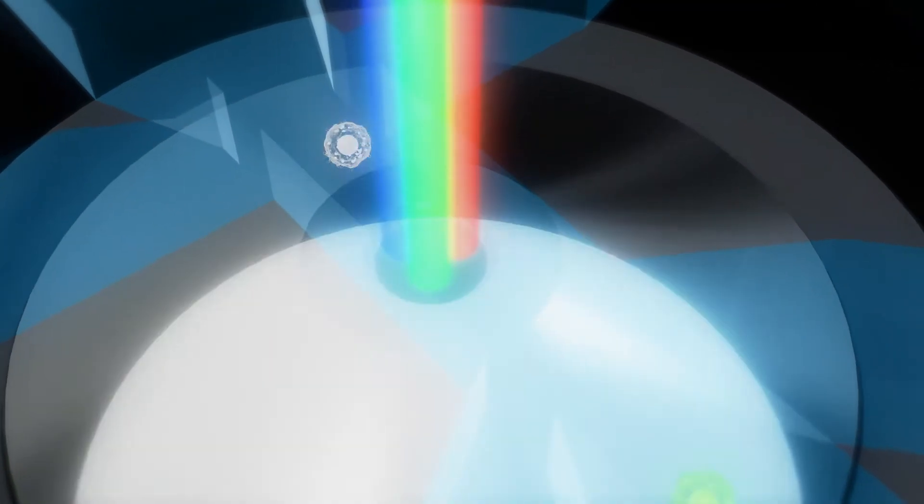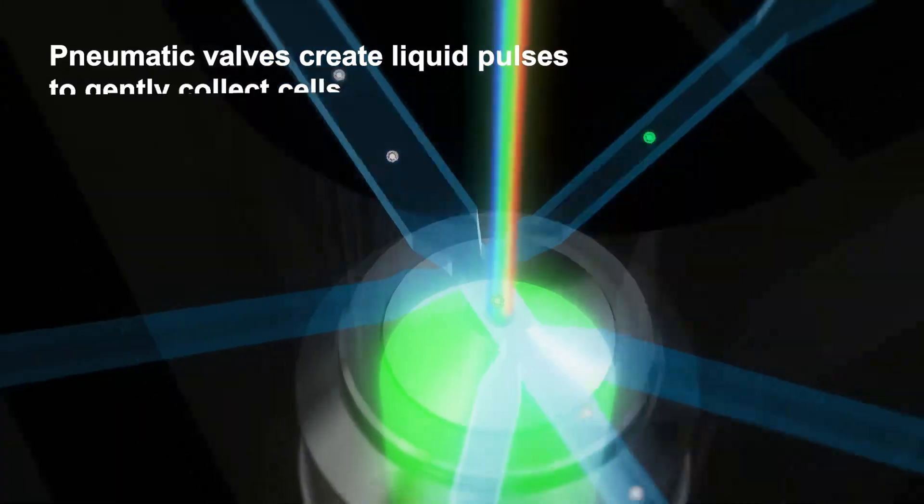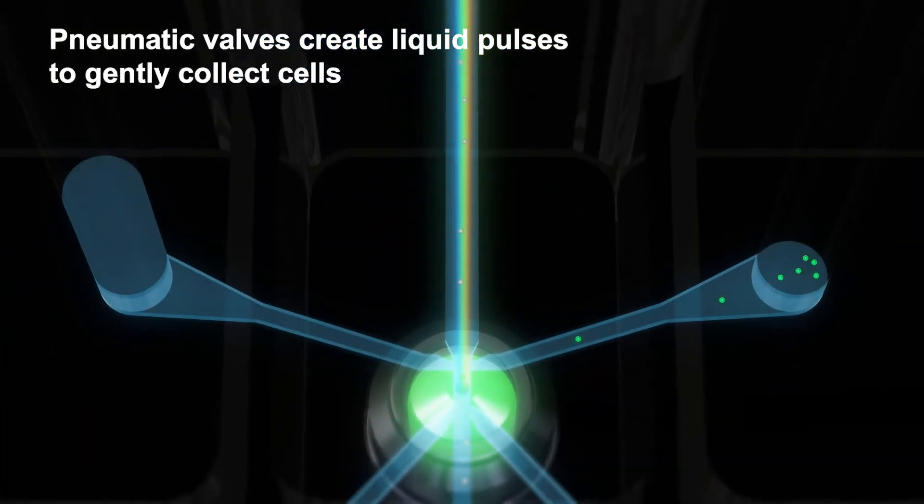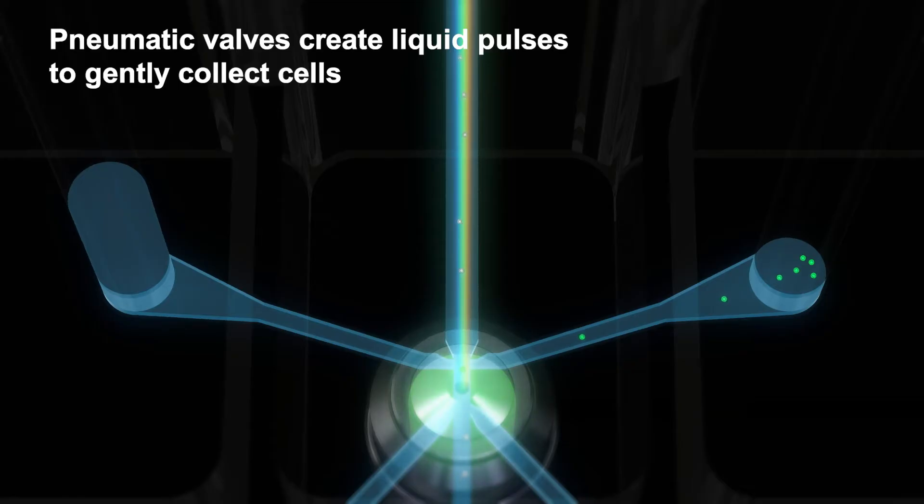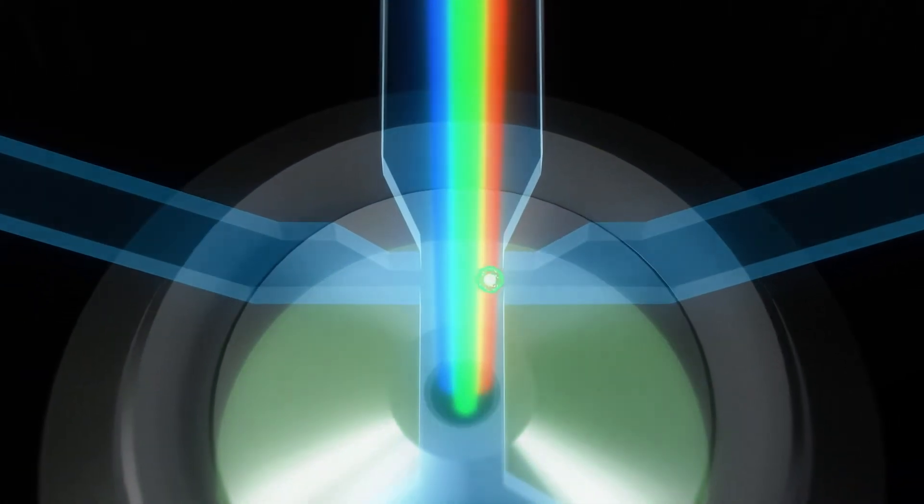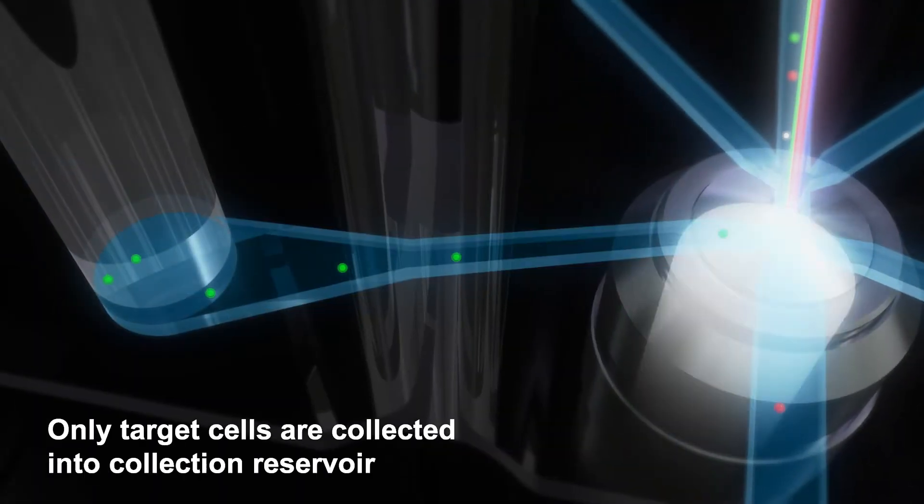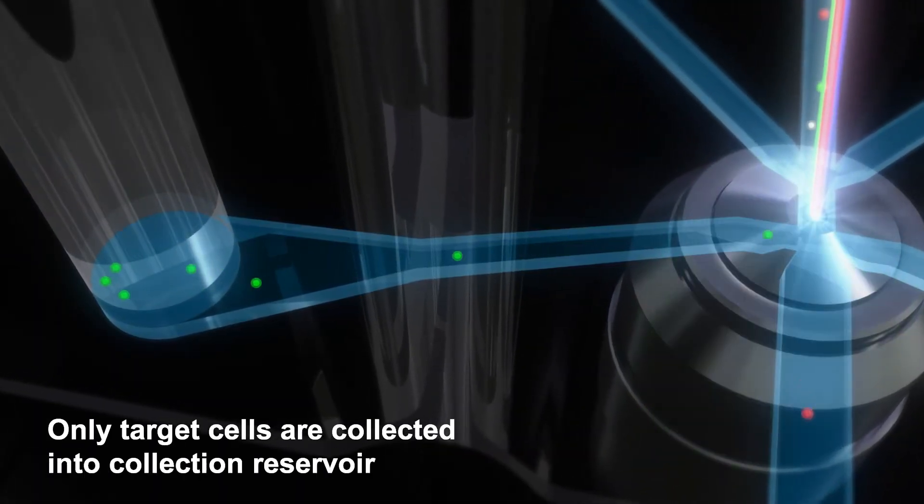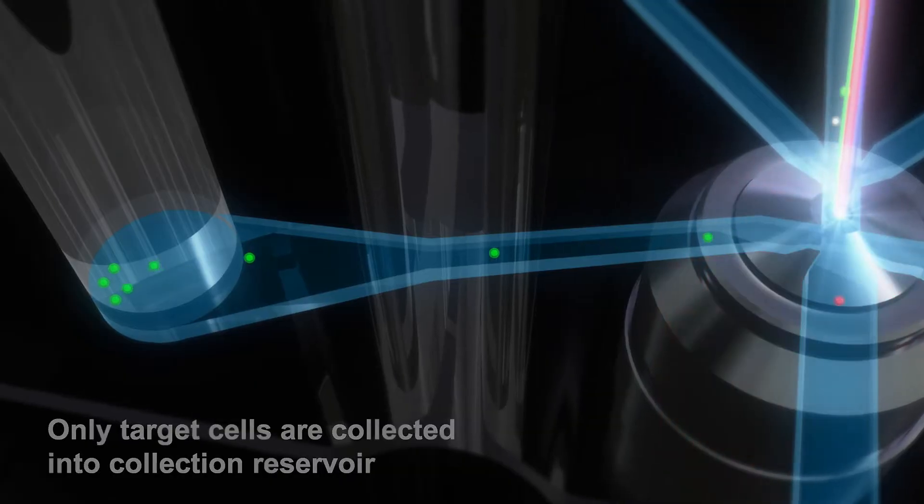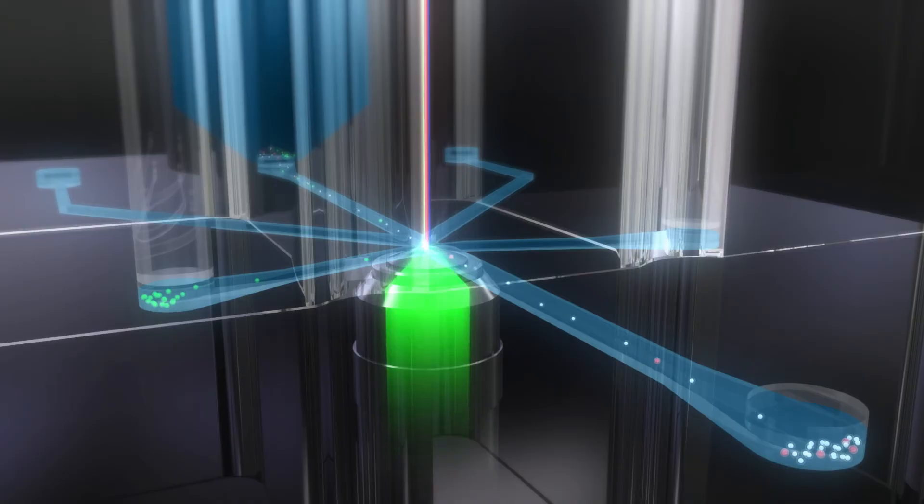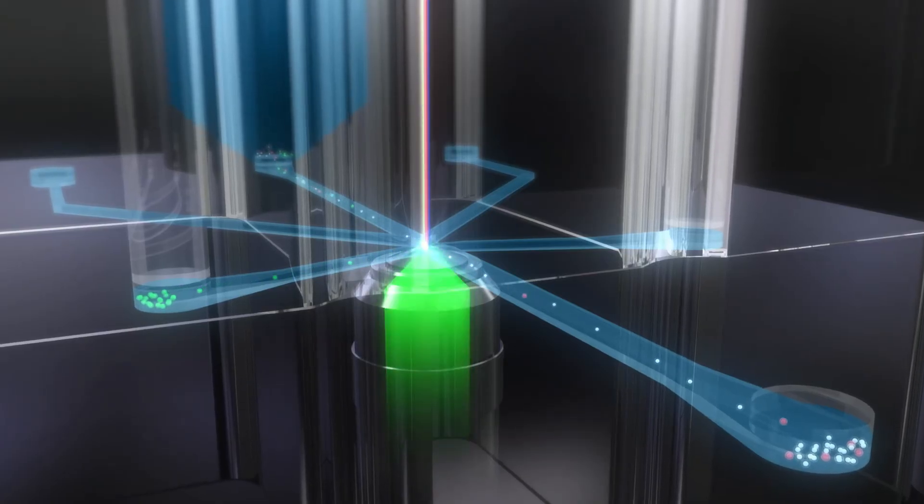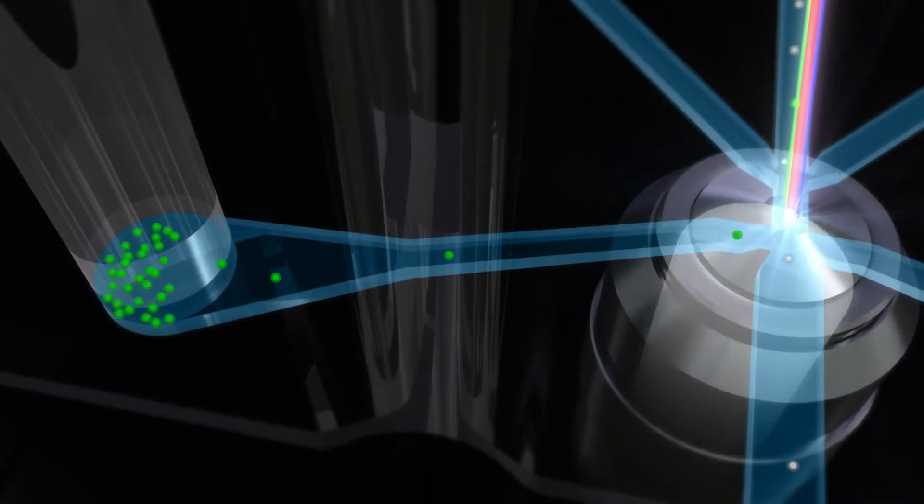When a target cell is detected, the pneumatic valves open and close momentarily to generate a liquid pulse that pushes the target cell into the collection reservoir together with the surrounding liquid. This process is repeated at a high rate of up to 1,000 times per second.